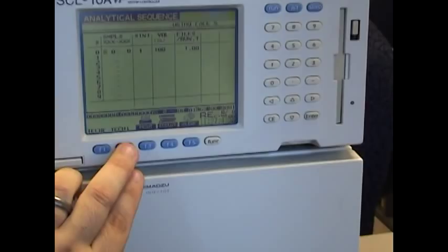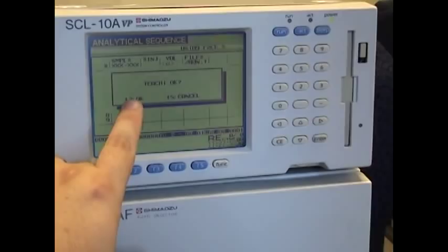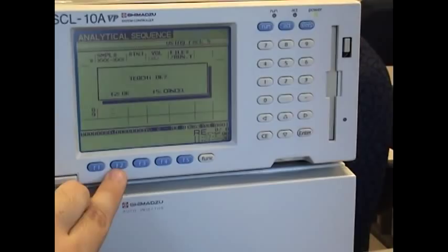From here, hit F2. It will ask you, teach okay, F2 for okay again. When you do this, you cannot stop. You have to go through the entire teaching process once you've hit this.